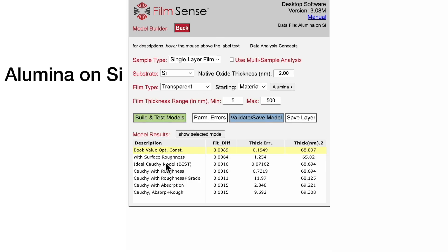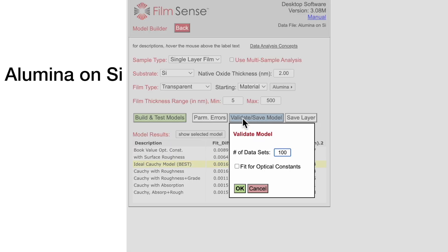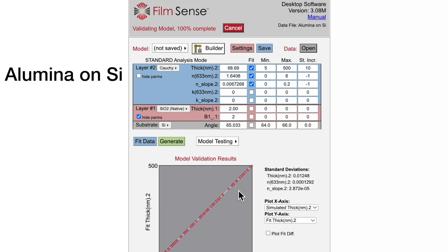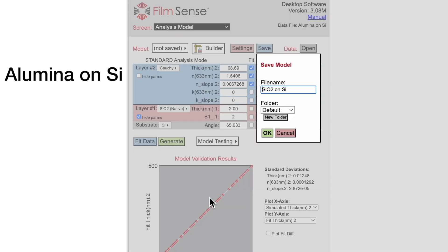Going back to the best model, model convergence over the full thickness range can be tested by clicking on the Validate button. If successful, the model can be saved and used for other similar samples, which completes the model building and testing process.